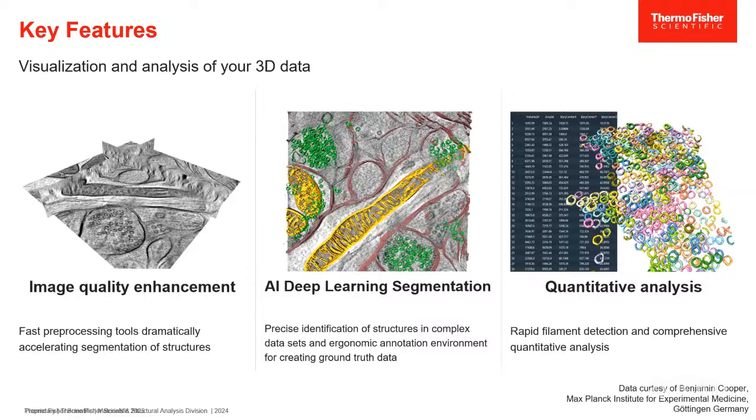And just to expand a little bit more, if you yourself had annotated data on your cryo images or whatever, and you had a colleague somewhere else on another campus that acquired their own data set and annotated it also, and you wanted to create a model that would try to predict well on both types of data sets, in AMIRA you could combine both data sets and the annotation associated with them and train that model. So it's pretty easy to just combine data sets and train a model that represents both of them.